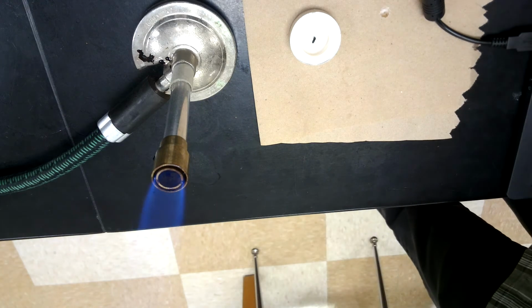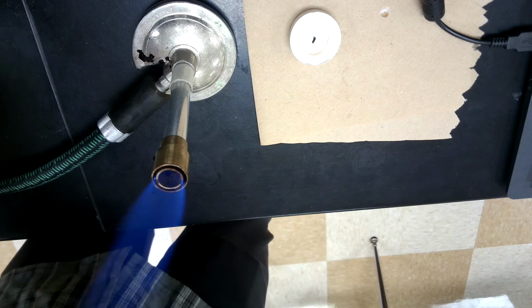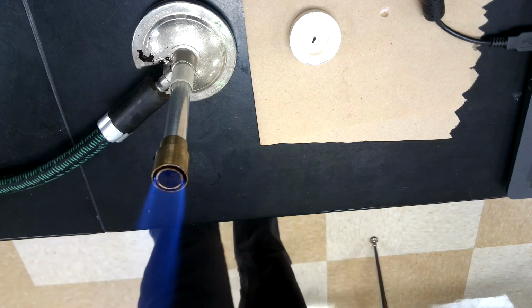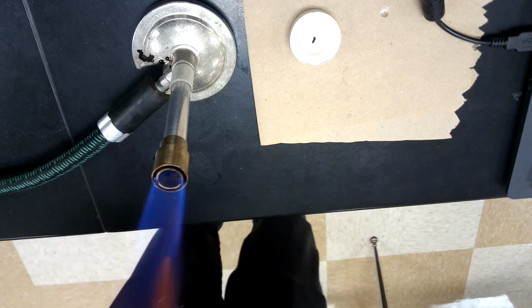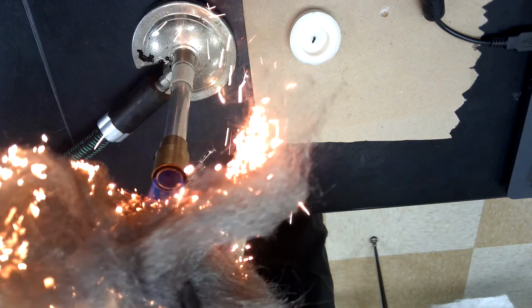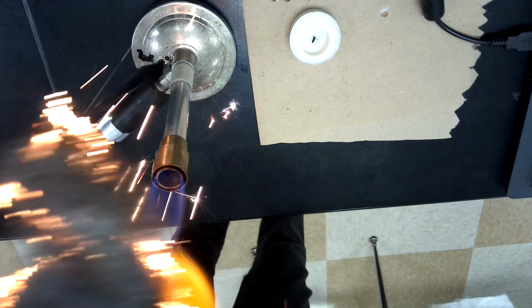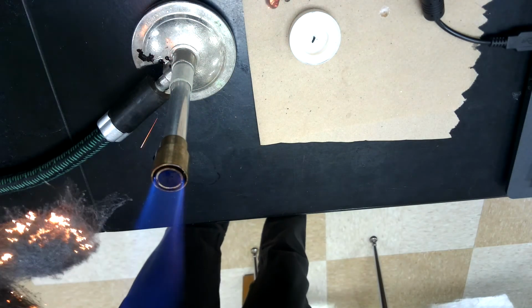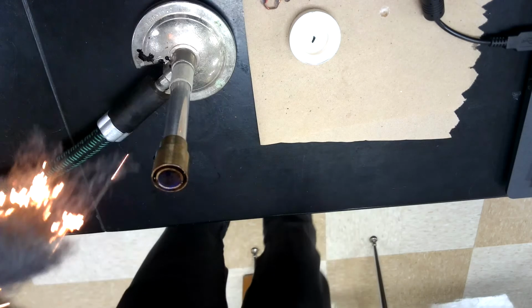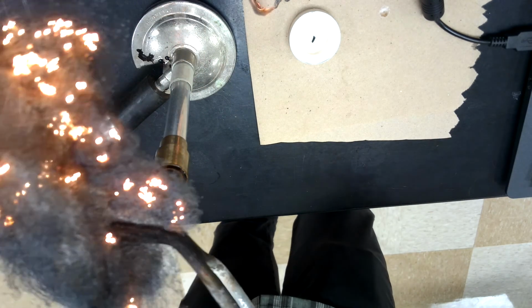We have the Bunsen burner, and I think I have my tongs over here. Tongs for safety. And you get a piece of steel wool. Maybe you've seen this trick before, maybe you haven't. When you put steel wool into the fire, steel wool is made of steel. It's made of metal. Yet it does some crazy stuff. It actually keeps going. Turn off my fire here even. And it looks like it's on fire. That's because it is.